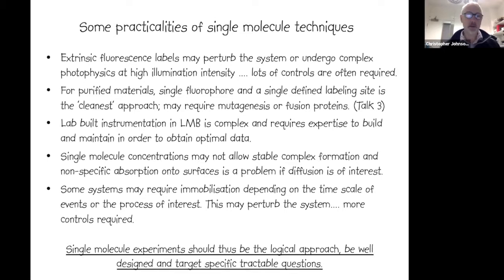Within the LMB, the instrumentation that we have is home built, or I assembled the instrumentation, which is actually just behind me in the room that I'm in. And it requires some expertise to build. It's not particularly difficult, but to construct and maintain it and obtain optimal data requires some level of expertise.